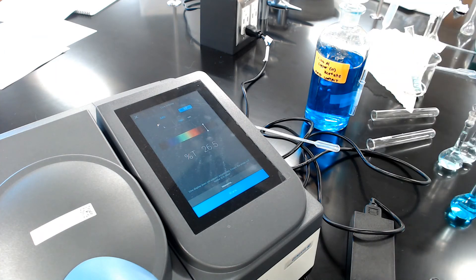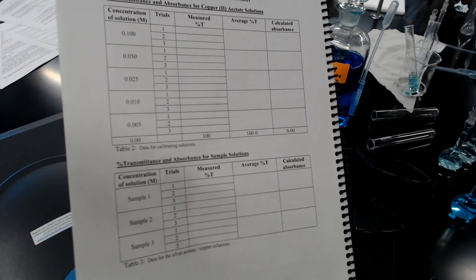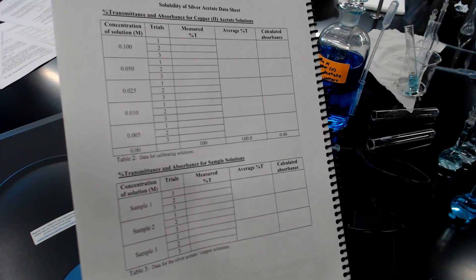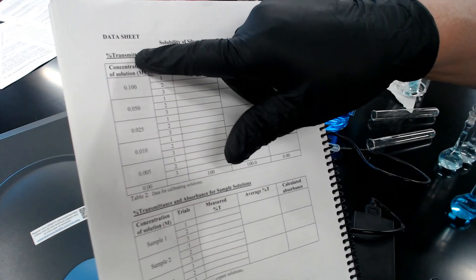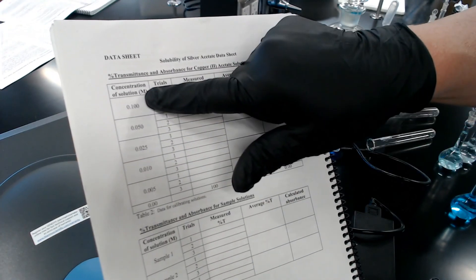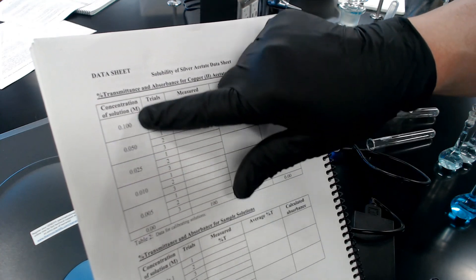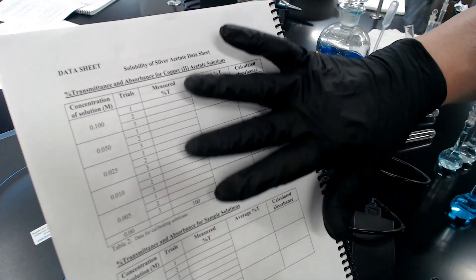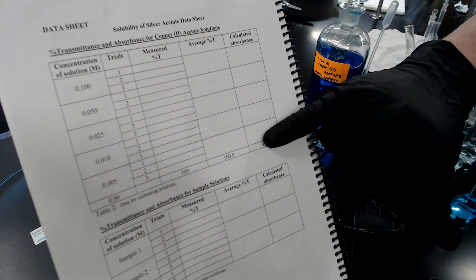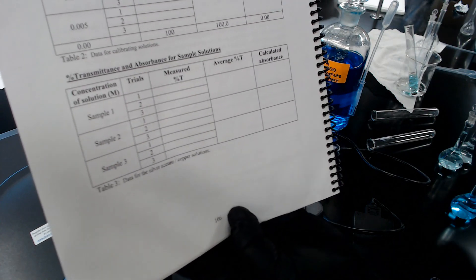You'll do that for all three samples. When measuring calibration solutions, go from lightest to darkest — from the bottom up — because any carryover from a dark solution will contaminate lighter ones, but not vice versa. Measure your data three times, take the average, calculate the absorbance, and record the data for all three test tubes. Once you've recorded all those numbers, you're done.